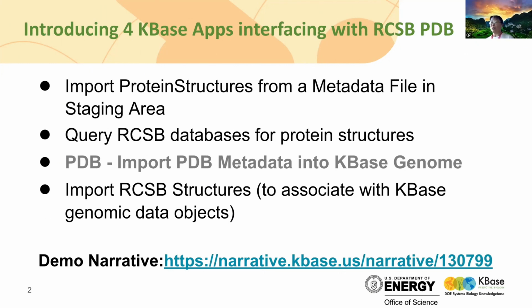And not only that, but also behind it, I dug into many of the data, the annotation data included. And now we learned not only those data, but also so many tools, what Dennis and Brenda and Qizhi just presented. On the other hand, my boss, Chris, and my colleague, Zhang, also presented from the scientific front that KBase also has its own strength, especially the genomic data.